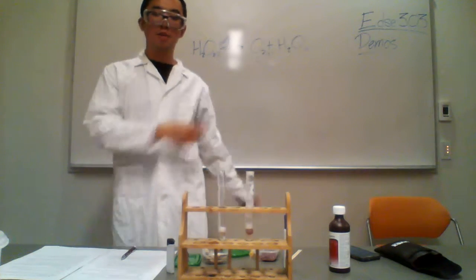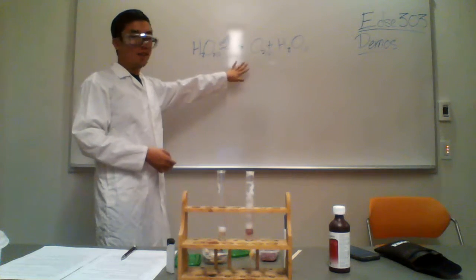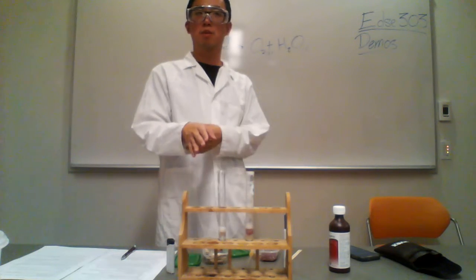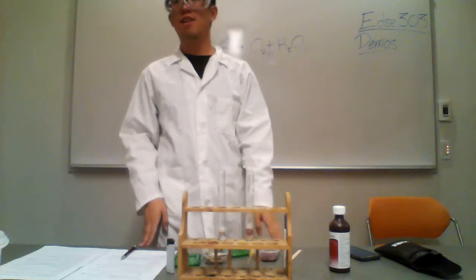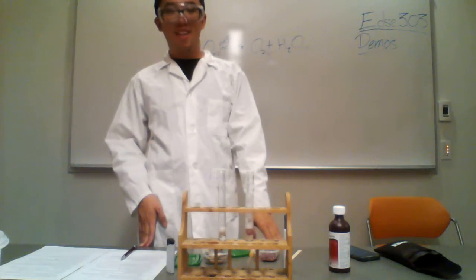Yeah, so basically we already know what this reaction would produce, right? Oxygen and water. So what would be a good way to test that maybe the reaction has gone through, given that I have a lighter and some wooden splints here? Could you burn off the oxygen produced?